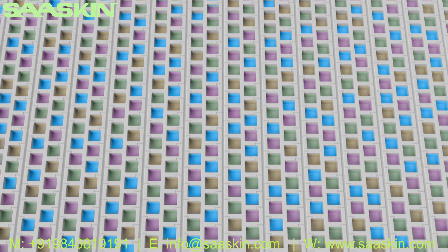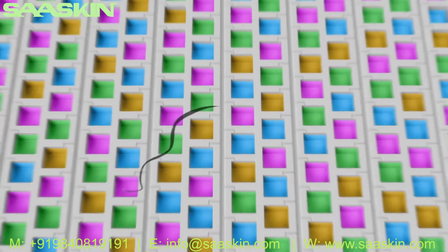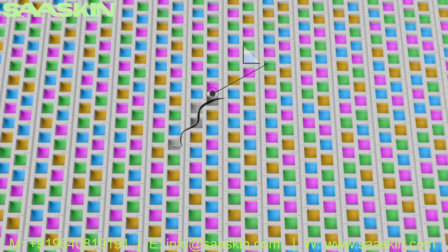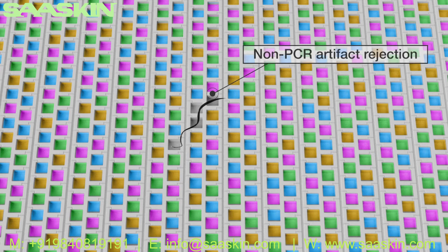Four optical channels allow you to analyze more targets per sample. As the only digital PCR solution with capabilities for pre and post PCR background subtraction, the QuantStudio Absolute Q System employs sophisticated rejection of non-PCR artifacts, offering high confidence and true positives for every microreaction.